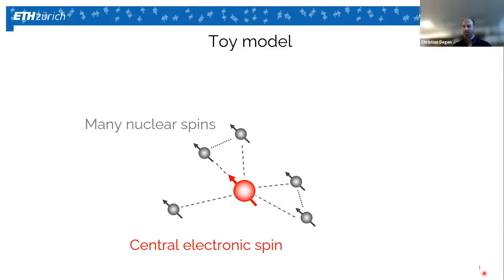So to give you some numbers where we operate, we're in an exotic regime at very low field. So we tend to operate between 0 and 200 millitesla using permanent magnets. And if you convert this to Hertz numbers, our electron spin is at a few gigahertz frequency. The nuclear spins, carbon 13, around a few megahertz. And then the couplings we'll be looking for, these are hyperfine dipole interactions, or 1 to 10s of kilohertz.